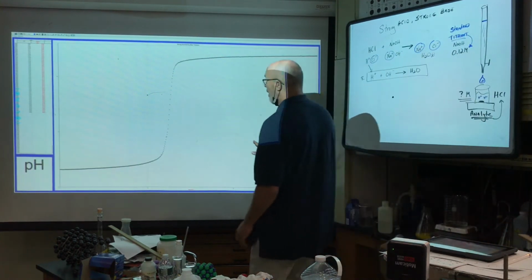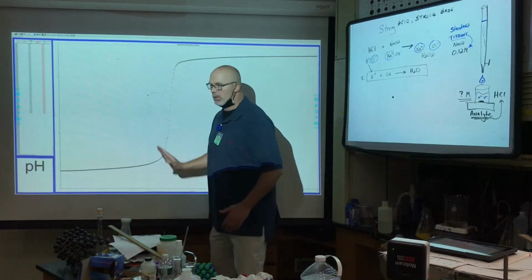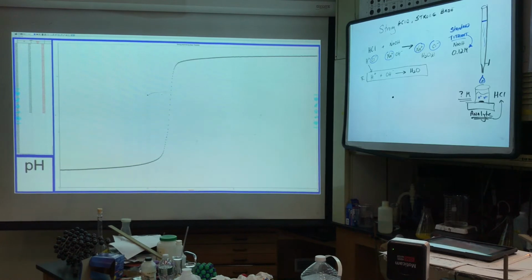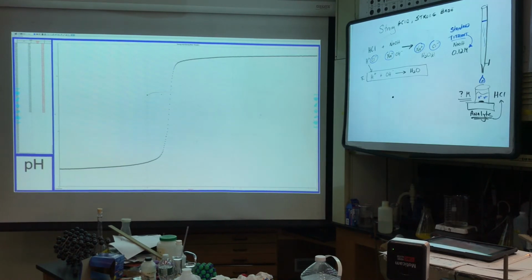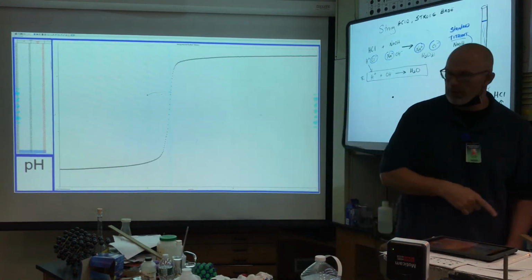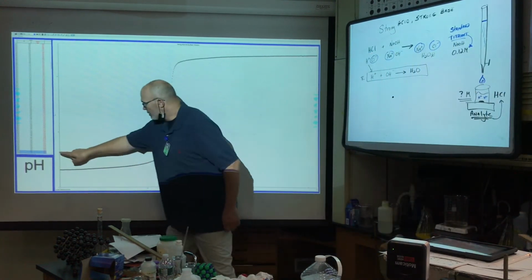Now, I'm going to drag, okay, the cursor right in the middle to find that value. Okay, so I don't know where my cursor is. There you are. So all I'm going to do is drag right there. And you see that, it's hard to see, you can't see it here, but I dragged, and it's actually picking for me the actual data points.